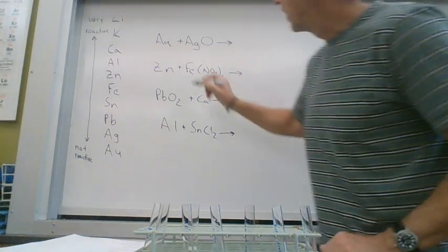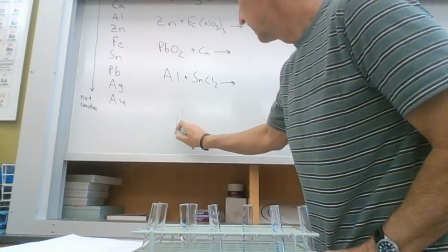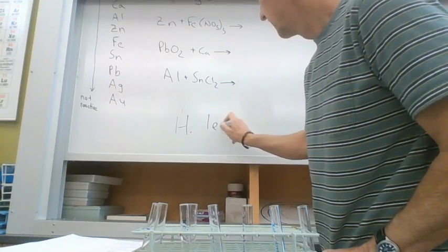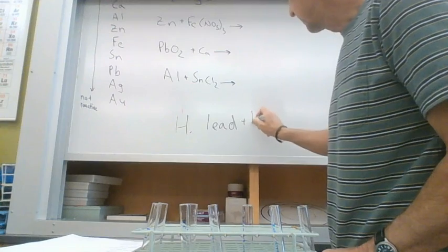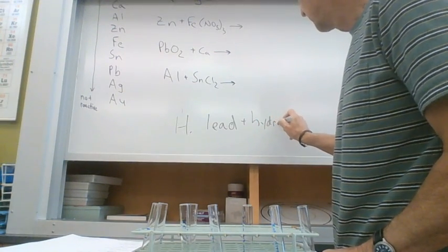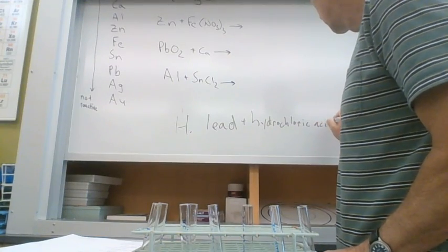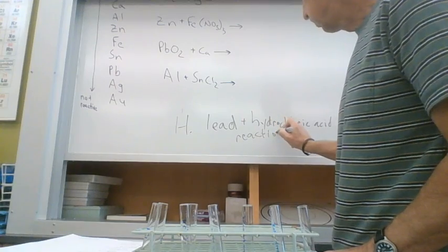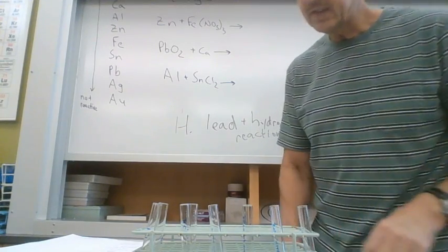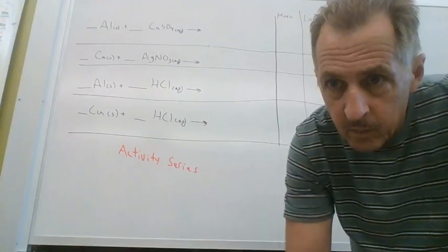So you should be writing down H, lead plus hydrochloric acid, and that you saw a reaction with that. I will be posting this data on Canvas, so you can go back and try to record it.